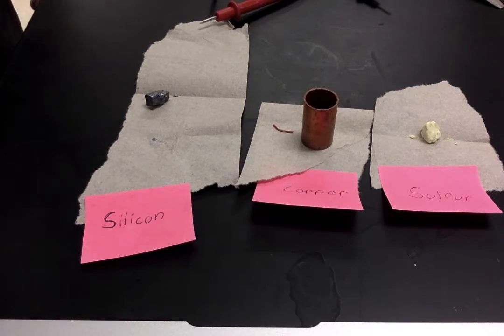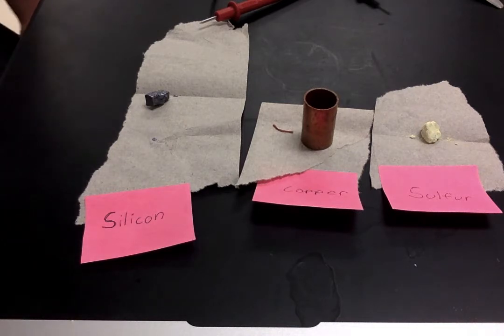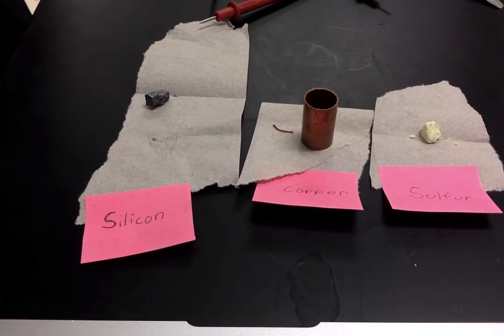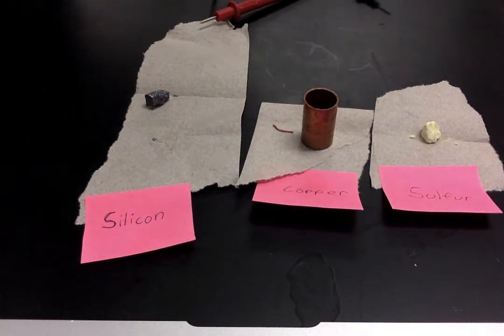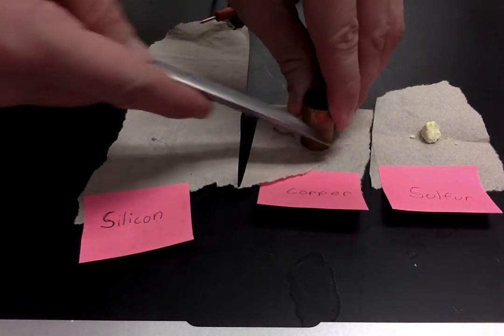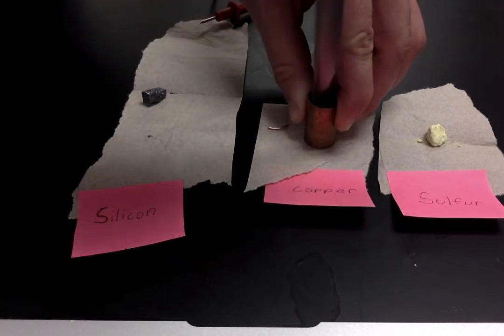Well, I didn't shape it, but someone shaped it into a couple different shapes. And so that one is going to be the most malleable. So rank that one as number 1. The one that's the most brittle, when I use my spatula, it should break off into little pieces.